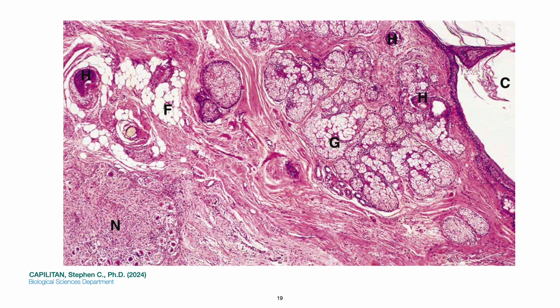Teratomas in medium power. Teratomas are tumors derived from germ cells and most commonly arise in the testes or the ovary. The tumors contain neoplastic tissues which are derived from all three germ layers, the endoderm, mesoderm, and ectoderm, including neuroectoderm, and thus can contain tissues as diverse as skin, fat, thyroid, brain, and muscle. The tumors range from benign to highly malignant.